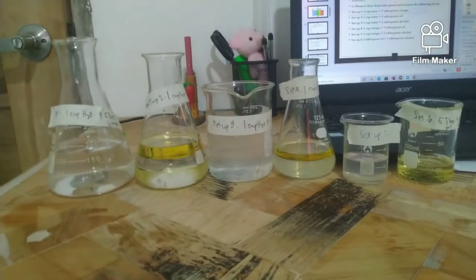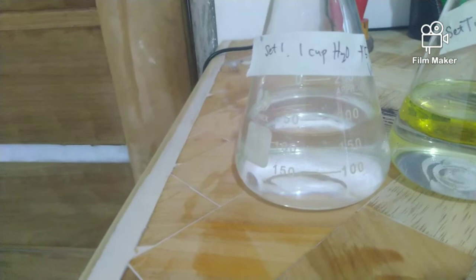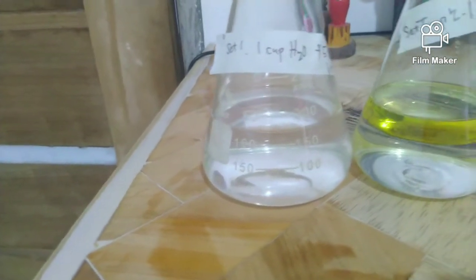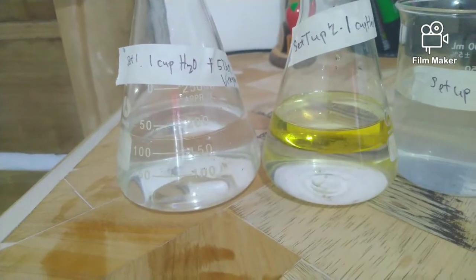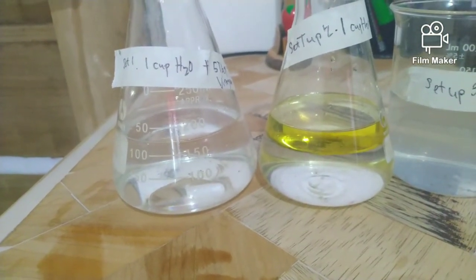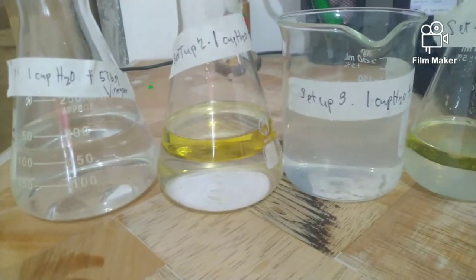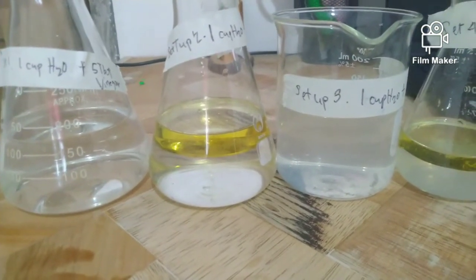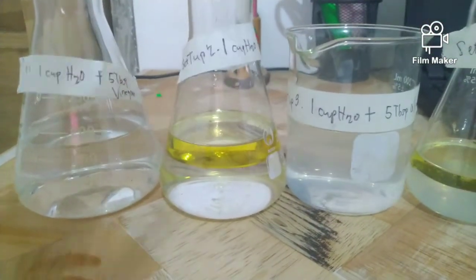These are now our mixtures. Let's look closer at setup number 1, the mixture of water and vinegar. This is setup number 2, the mixture of water and oil. Setup number 3 is the mixture of water and alcohol.